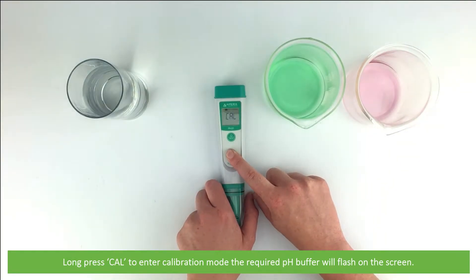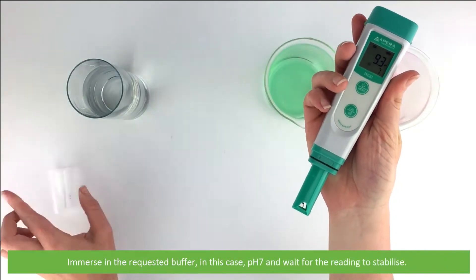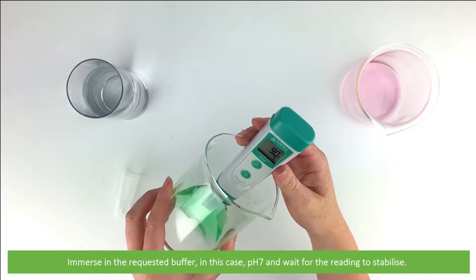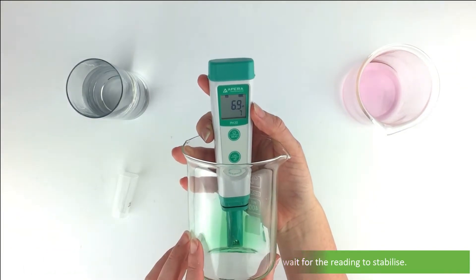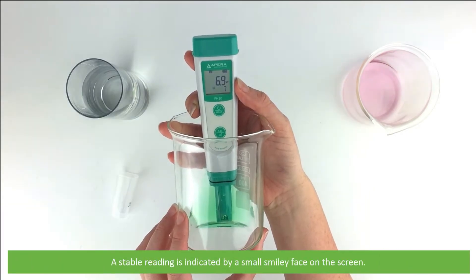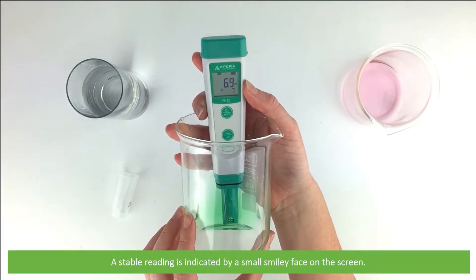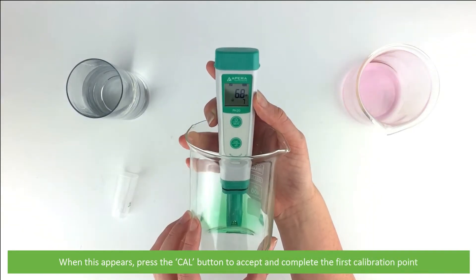The required buffer will then flash on the screen. Immerse the electrode in the requested buffer — in this case pH7 — and wait for the reading to stabilize. A stable reading is indicated by a small smiley face on the screen. When this appears, press the Cal button to accept and complete the first calibration point.